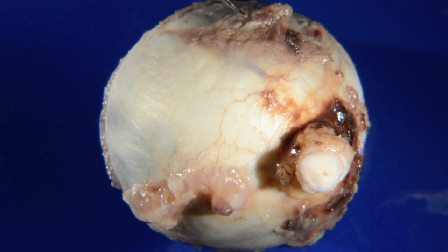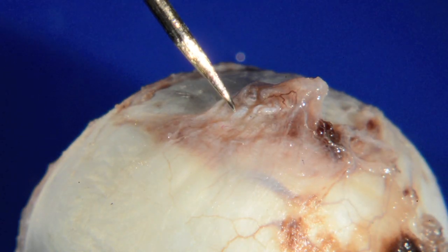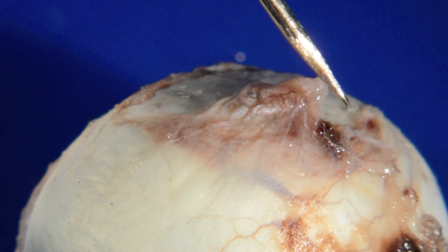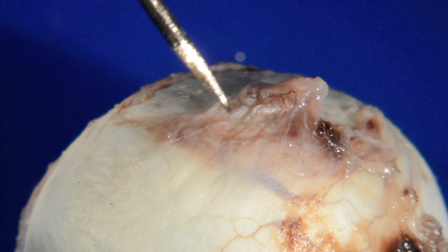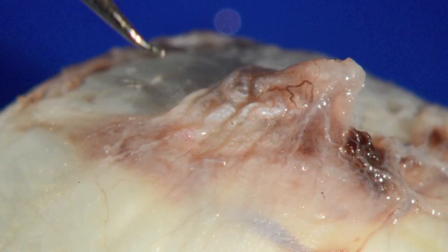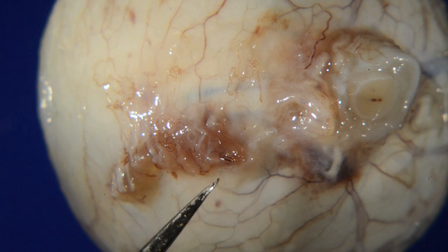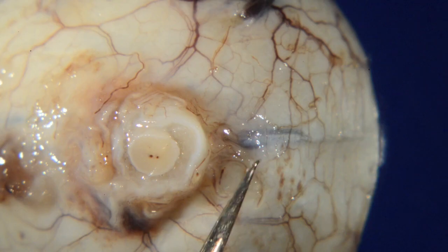The insertions of the oblique muscles form a sling on the temporal aspect of the globe. The superior oblique muscle inserts via a tendon, superiorly and temporally. The superior oblique tendon is marked by a series of parallel white lines. The inferior oblique muscle lacks a tendon. Its muscle fibers insert directly into the inferior sclera, temporal to the optic nerve.